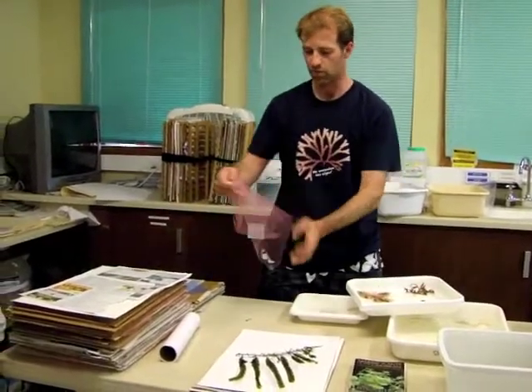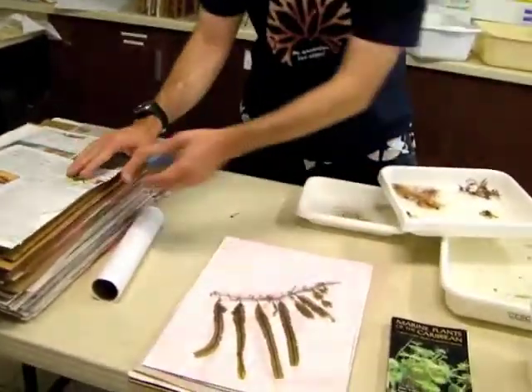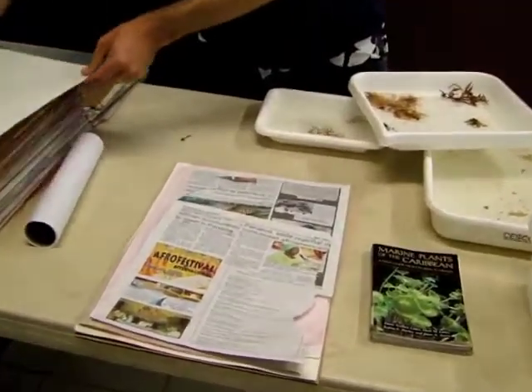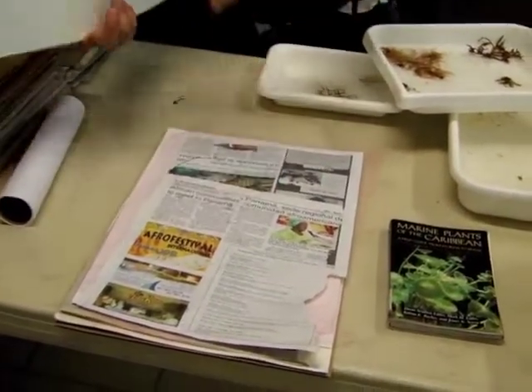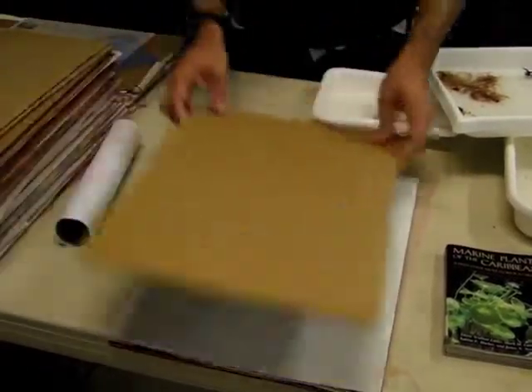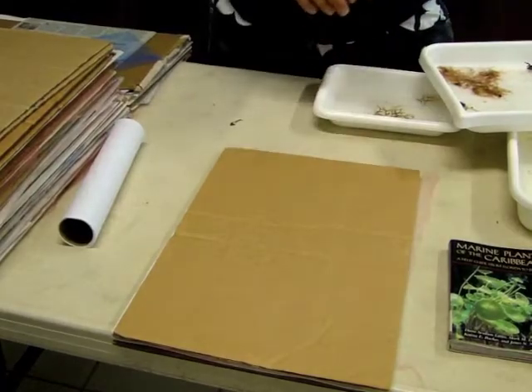To dry it, we put a piece of tulle on top — this is just to keep the specimen from sticking to the newspaper that we layer on top so that it can dry. Then we have newspaper, a little felt, and a piece of cardboard. We keep layering the specimens up, and ultimately we put them in front of a fan, or we just give them time to dry.